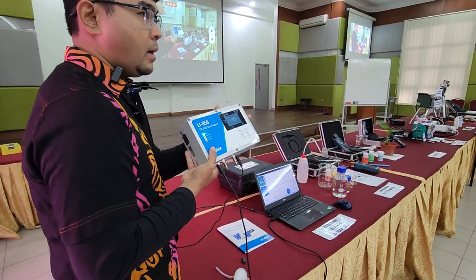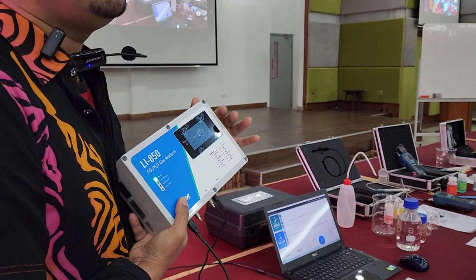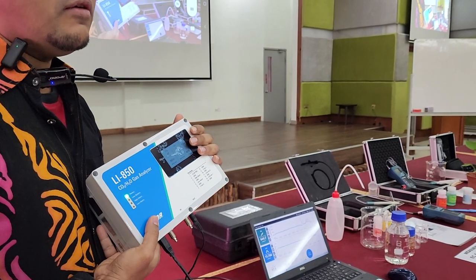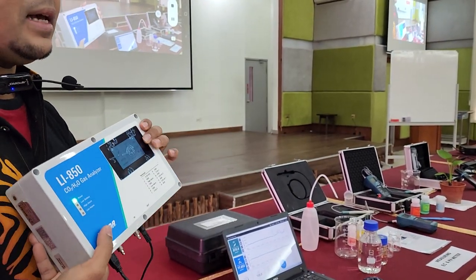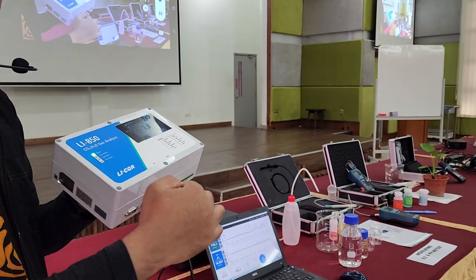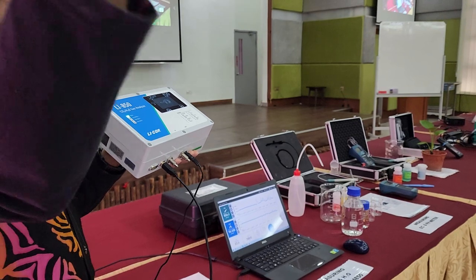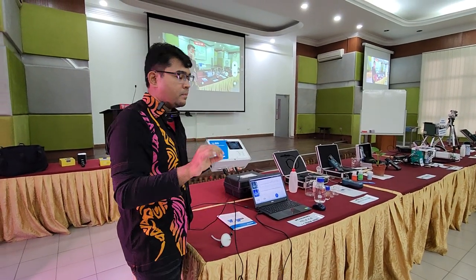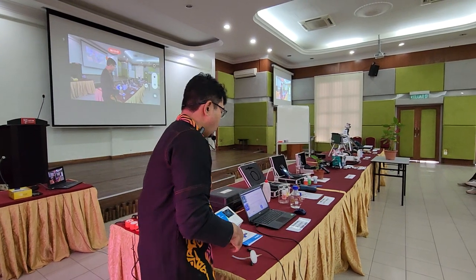So this equipment is from a company called LI-COR. LI-COR is not a Malaysian company. It's a US-based company, but it has multiple headquarters. We use a lot of products from this company, for physiology at least. The piece that I'm holding here is called a CO2 H2O gas analyzer. Why is this important? You see the inlet here. This inlet is equipped with an internal pump. This pump is going to suck in all the air in the surrounding. Then you're going to get two readings: the volume of water, as well as the amount of CO2, the CO2 concentration.